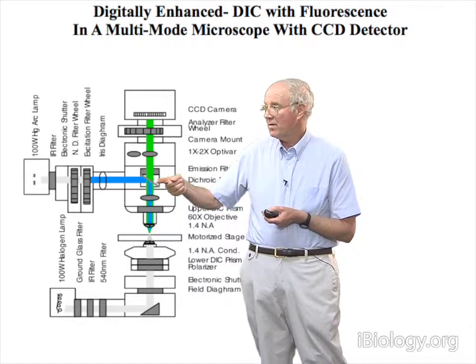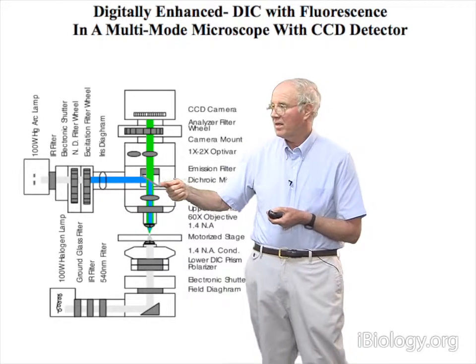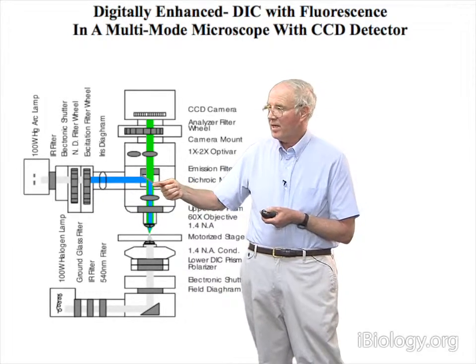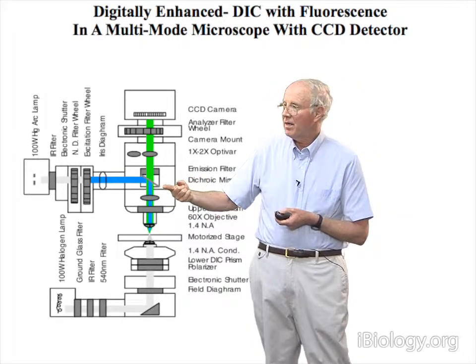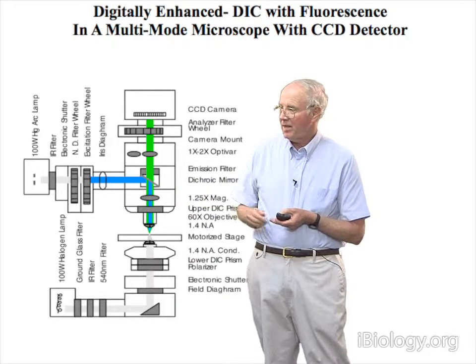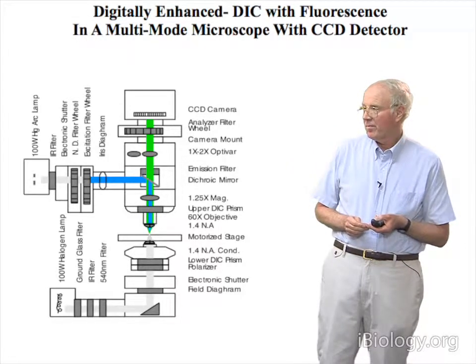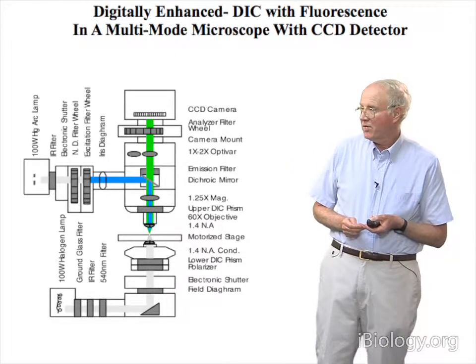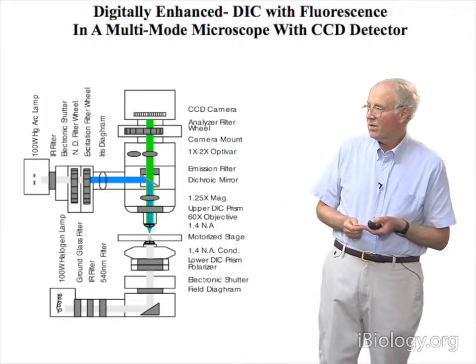You have to have a system for selecting the illumination here, and the wavelength you want to use for the DIC imaging is going to be the same wavelength that can be passed by one of these filter cubes. We often use a dichroic mirror in the light path that can do multi-wavelengths, blue, red, and green, so that lets you just use an excitation filter wheel over here to select which color fluorophore you're going to excite.